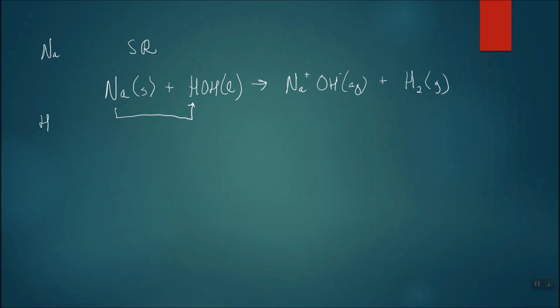And you saw it. It was a gas. You saw the bubbling. You didn't see the gas coming out of it once the sodium got to the surface. That was actually steam being produced by the fact that this is a very exothermic reaction, and some of that heat is being used to convert the water into steam. So that's our molecular equation.